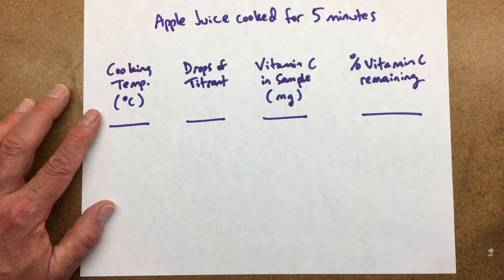So we're looking at two different effects. One is the amount of time, and the other is the level of temperature.